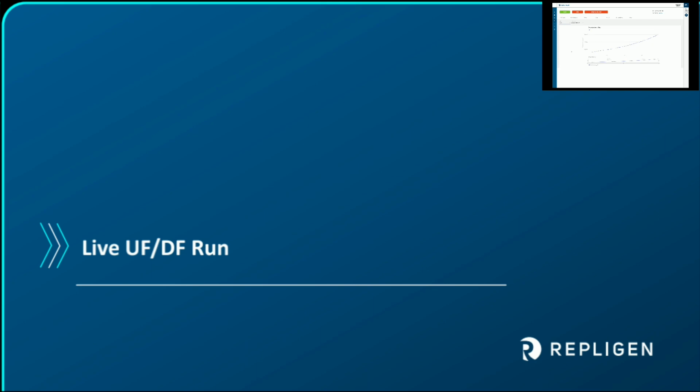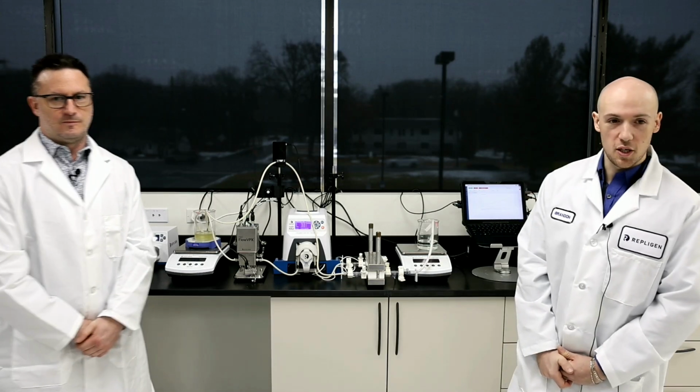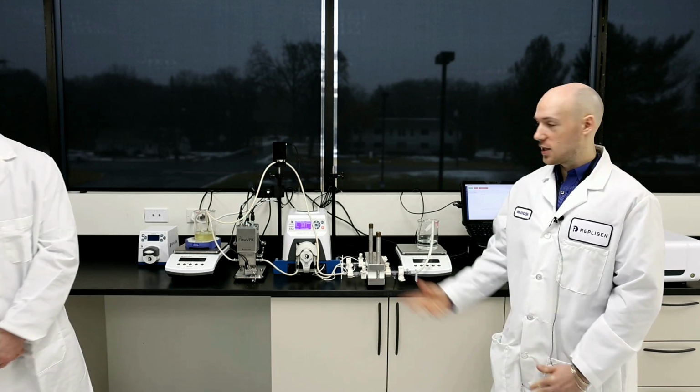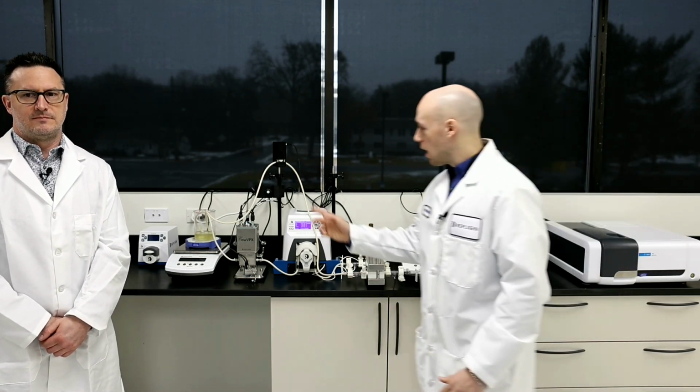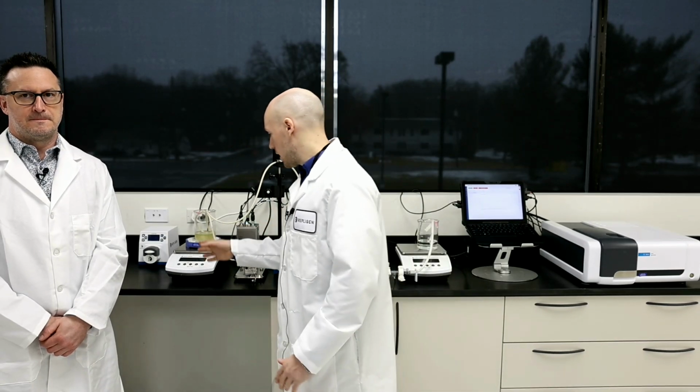Perfect. Thank you so much, James, for that presentation. So now we're actually going to go straight to the system. And basically, before I get into the actual system, I do want to remind you guys that please feel free to ask any questions in chat. We will have time at the end to cover all questions, hopefully.